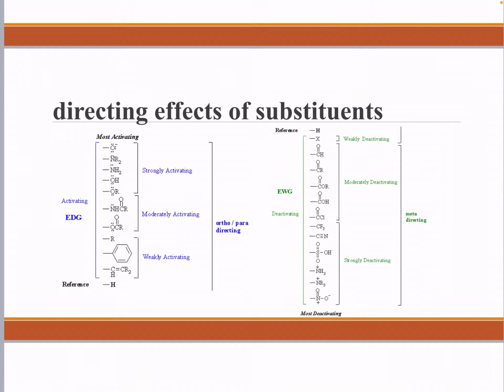So you will need to figure out the directing effect of the methoxy substituent based on this table, and then predict what's going to be the final product being synthesized, right? Spectral analysis can also give you some hints or some data for prediction. You also have the melting point range you can compare with. So I have strong confidence that you can successfully deduce the structure.